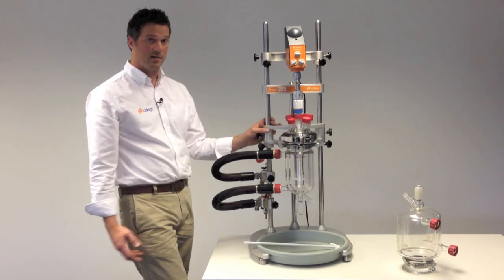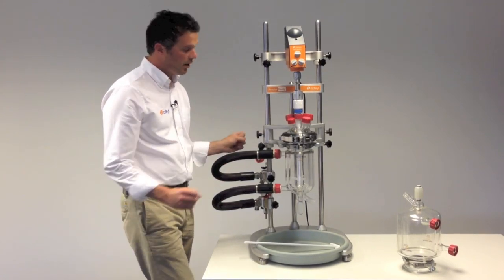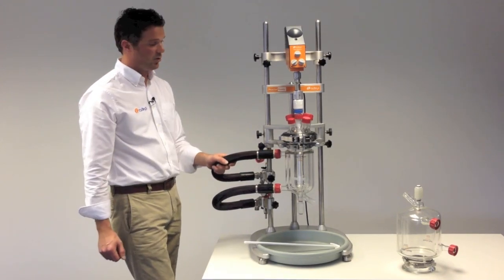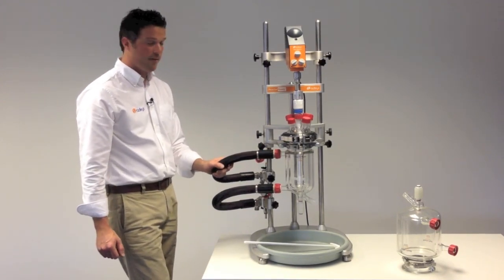So that's the reactor ready. A single framework that allows you to quickly exchange vessels without tools or mess so that you don't need to have multiple setups.